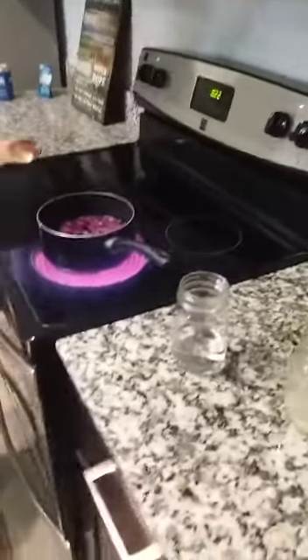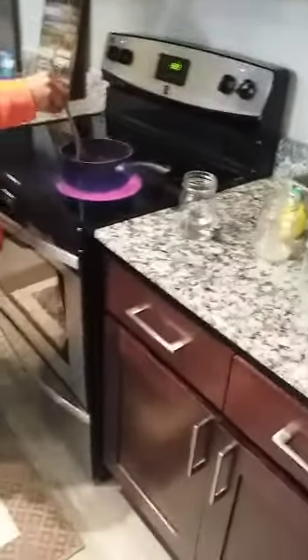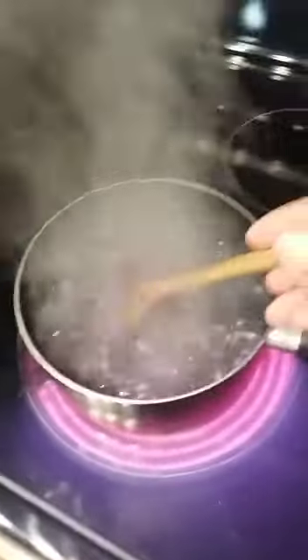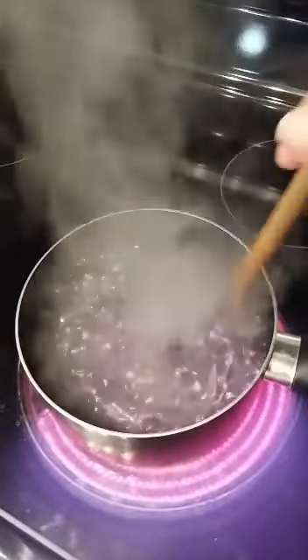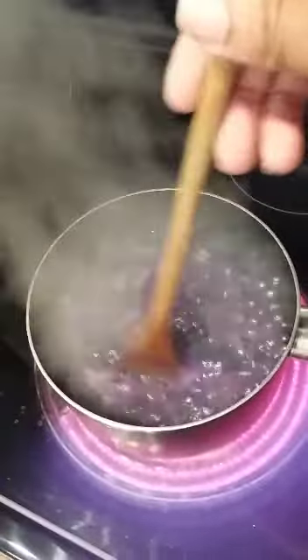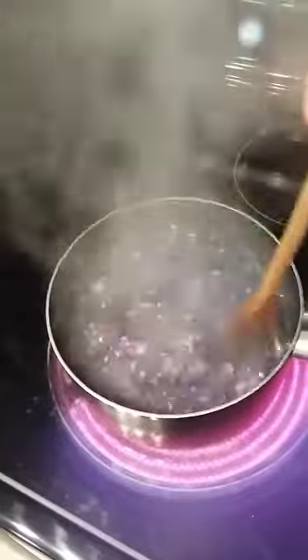All right, after our cabbage comes to a boil, and we strain the water, we're going to start by putting a little bit of cabbage in each jar and start observing our results. So our cabbage is, as you can see, boiling pretty well. I'm probably going to let it boil for a few more minutes just to make sure we get all of that wonderful indicator goodness.